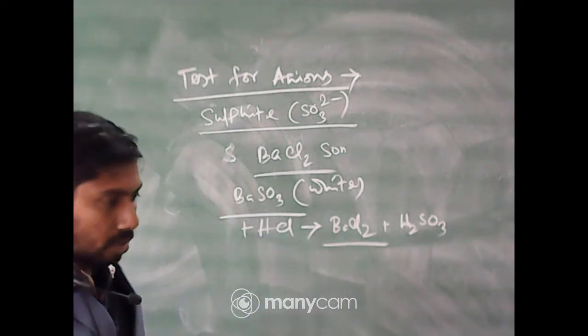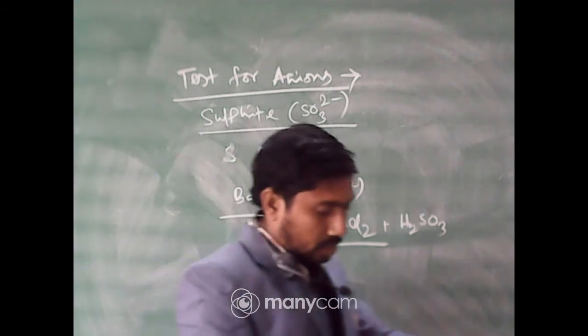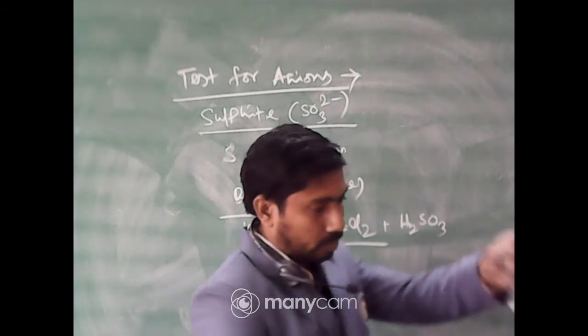Now we have to minimize the volume to prove it, just decreasing the volume.